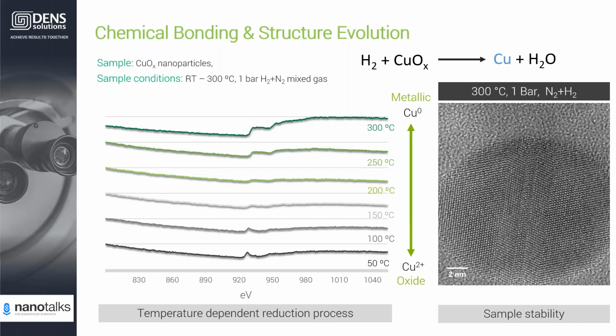And actually, when it comes to chemical bonding analysis, a lot of people question the possibility of EELS because of extra thickness involved in this process. We know actually EELS is kind of sensitive to thickness. So here is the example from a copper oxide reduction experiment.